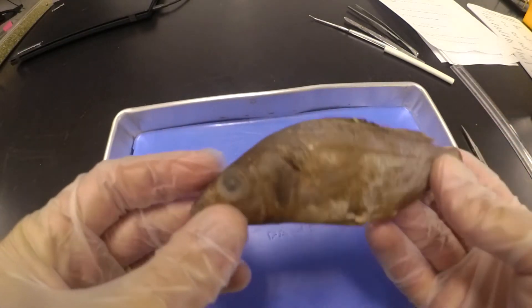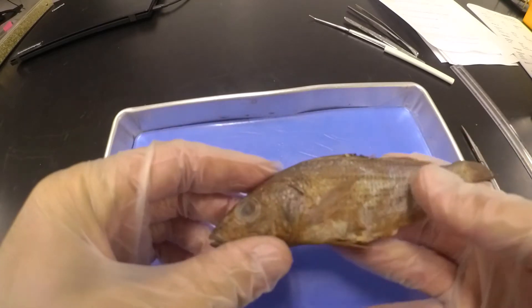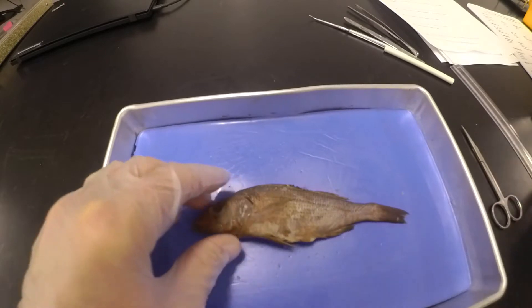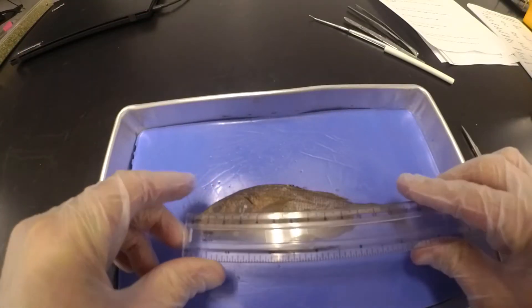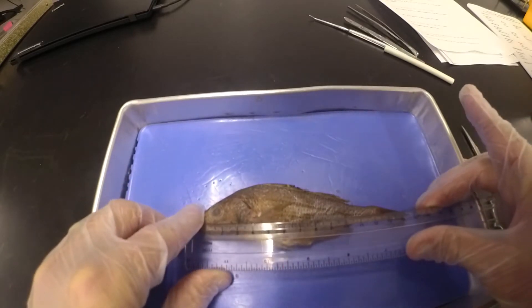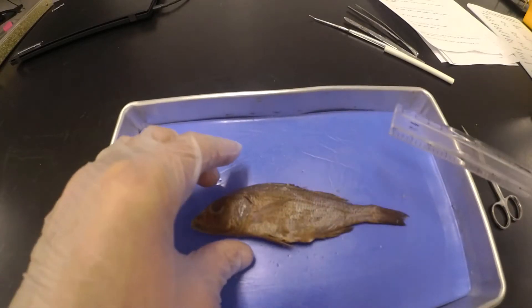Hello, today we have a perch, a type of fish, so we're going to go through our perch dissection. We're going to start with some external features and then after we finish those up we'll start looking inside. So first we're going to measure how long he is — it looks to be about 15.8 cm long.